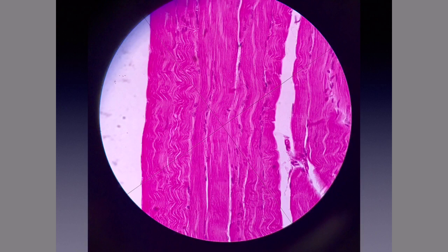And then finally, we are moving on to the fourth slide. There were only four slides in this exam, so this exam was much lighter on histology than the first exam.